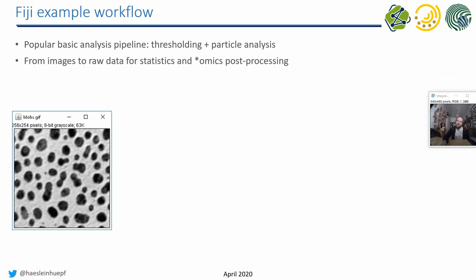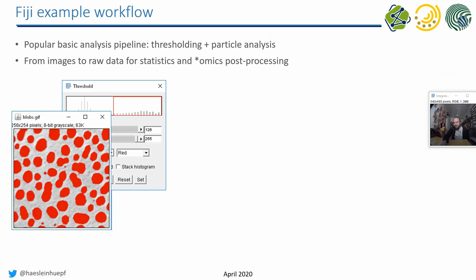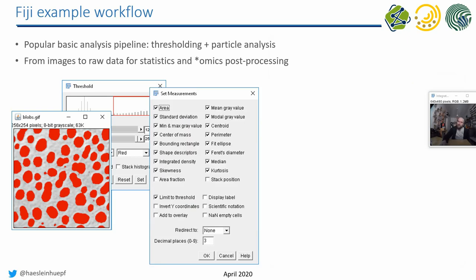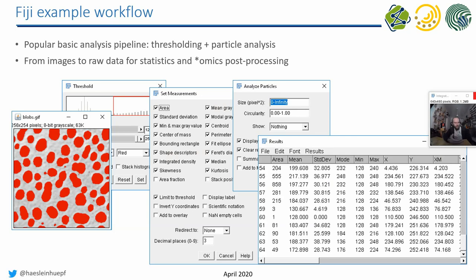A typical Fiji workflow looks like this: start from an image, apply a threshold to differentiate objects from background (objects marked in red), set measurements to tell the software what you want to measure — for example area, center of mass, standard deviation, mean gray value — then run the particle analyzer, which takes those measurements and the segmentation and outputs a results table. This is maybe the most common image analysis workflow in ImageJ.